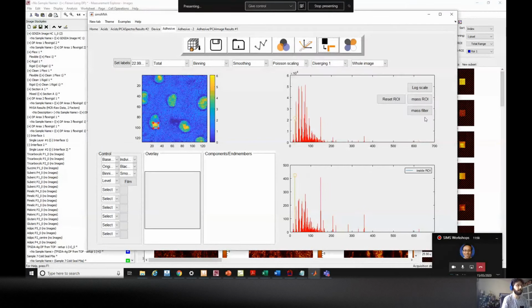So yeah, that's how long it takes. It's not that long, but if you're exploring things, trying different normalizations or range of variables or pre-processing, in the end it will take a very long time if you do it several times. Also, all the data sets are much larger than this. You have many more peaks and many more pixels.